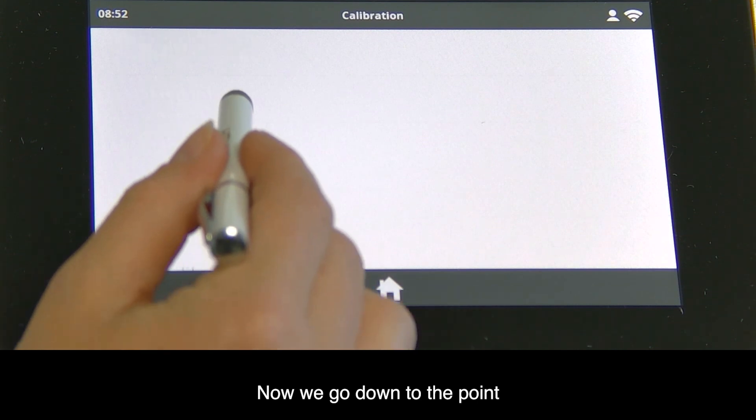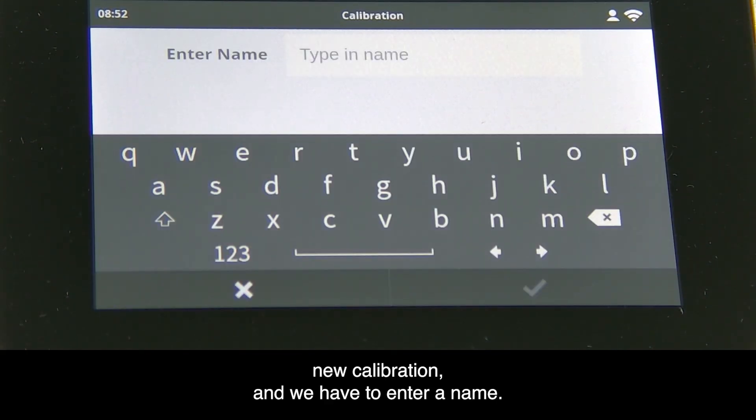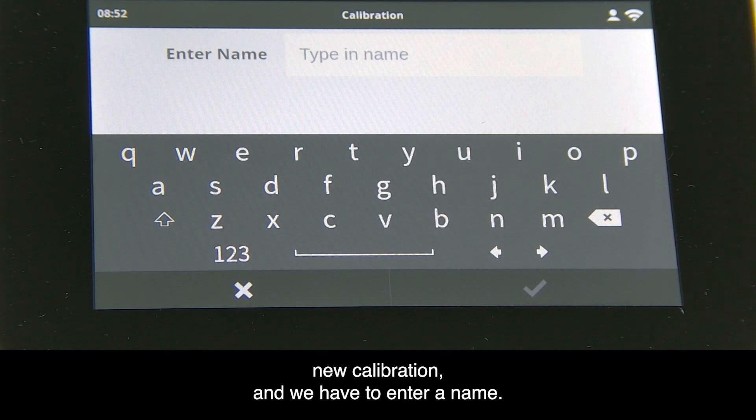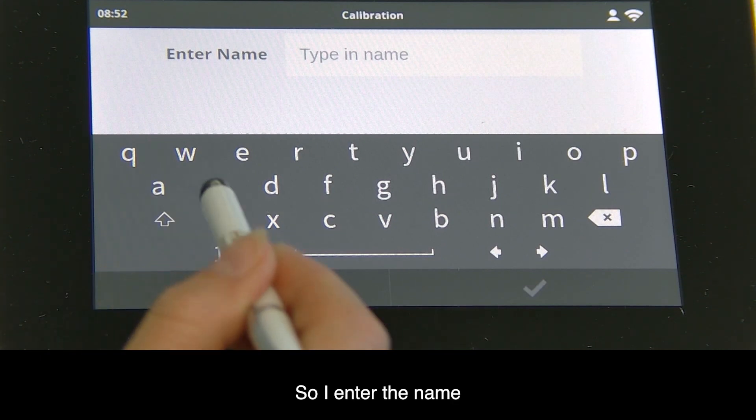Now we go to new calibration and have to enter a name. I want to show you how to set up an empirical calibration for phosphorus in liquids, so I'll enter the name.